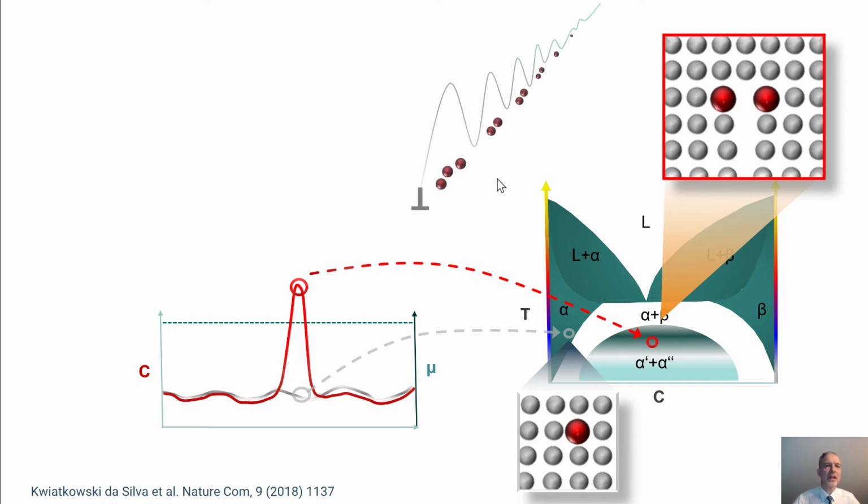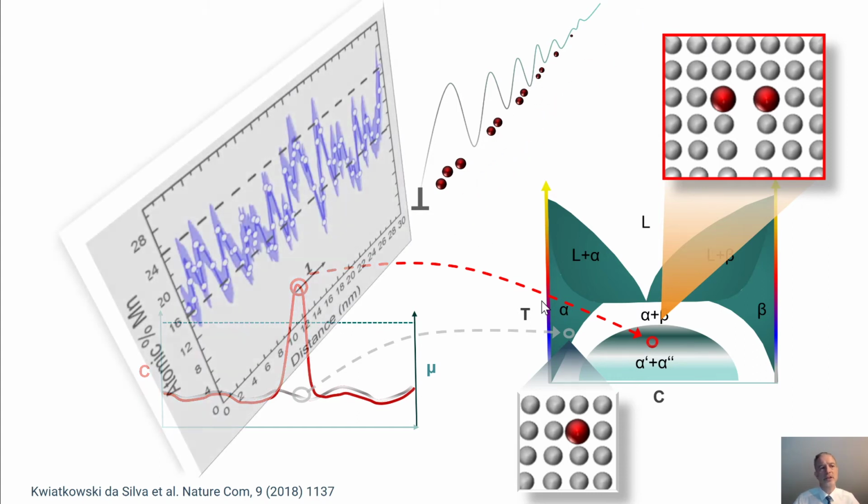And that can then lead to a one-dimensional or low-dimensional spinodal decomposition, such as schematically shown here, and that indeed corresponds to the experimental results that we have shown before.